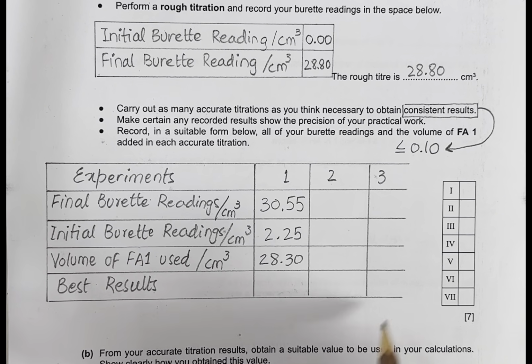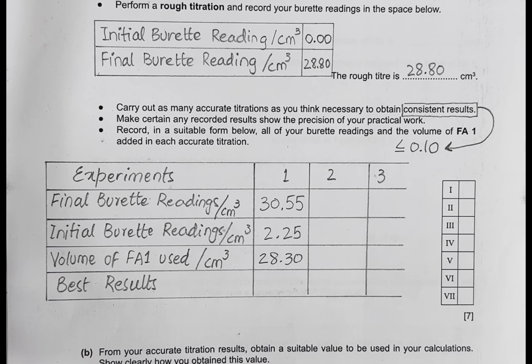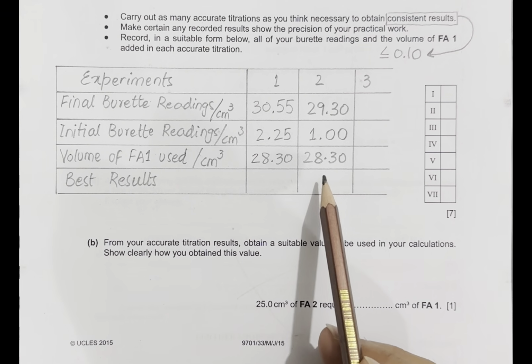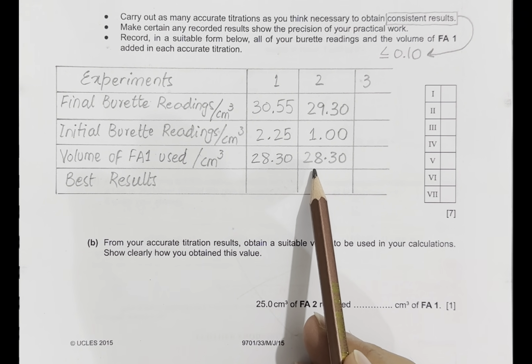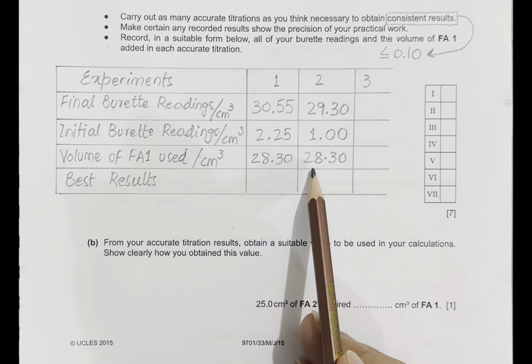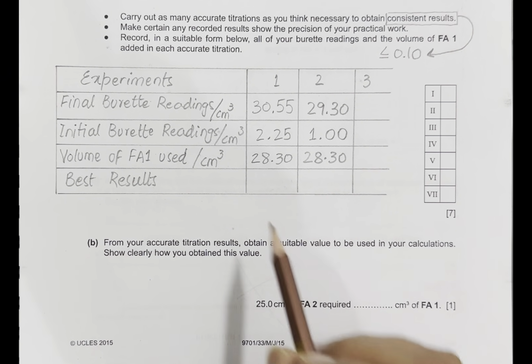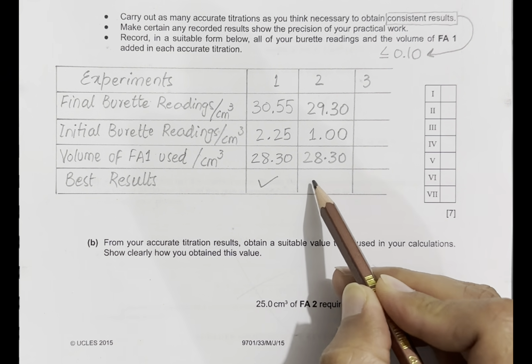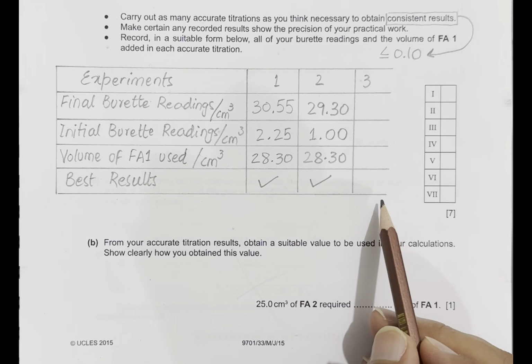Now let me repeat the procedure again to take the second reading, initial and final, to get a consistent result. Upon repeating the experiment for the second time, the volume of Fa1 used was the same as in the first experiment. Therefore, these two values are considered consistent results, and we will use these two values. We do not need to proceed for a third time.